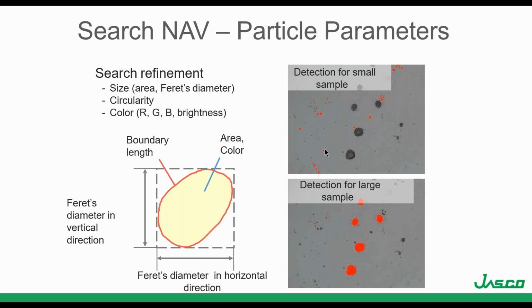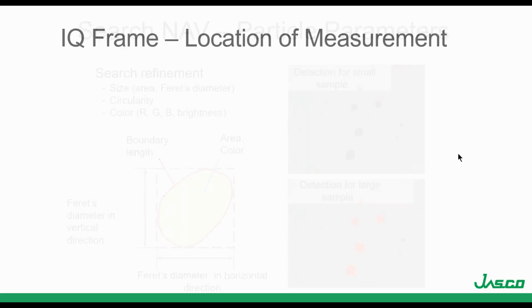Of course, you can select which samples to measure. Here are the small features, the small particles. Also, you can decide to measure only the large particles.